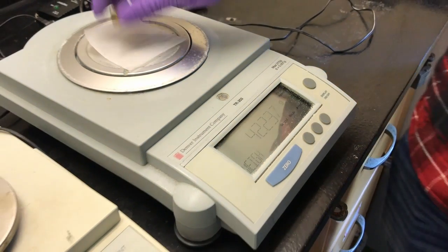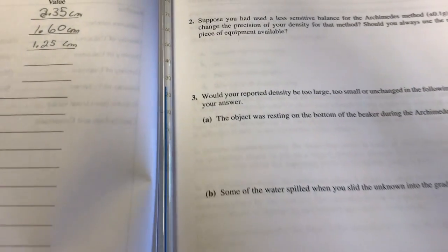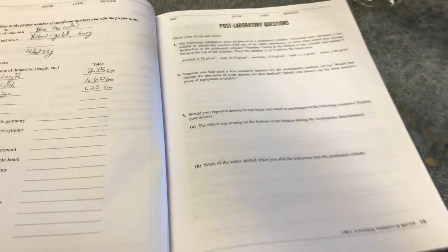42.233. So for this experiment, you also want to record the temperature. So the temperature that we have right now is 25.5.